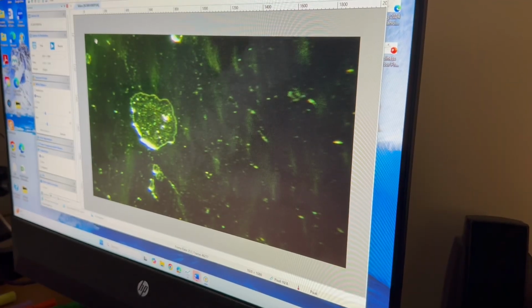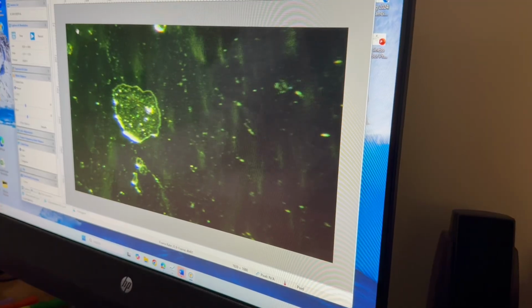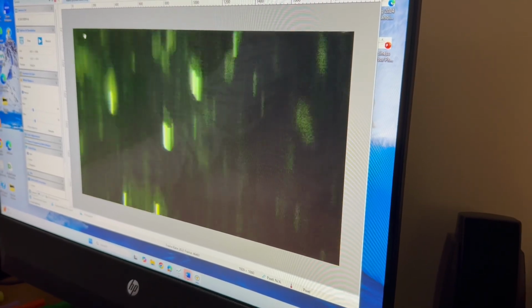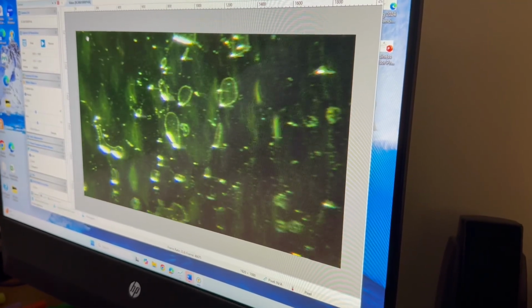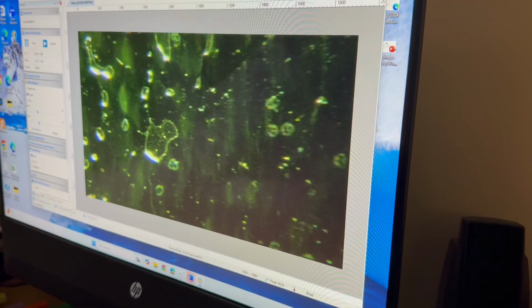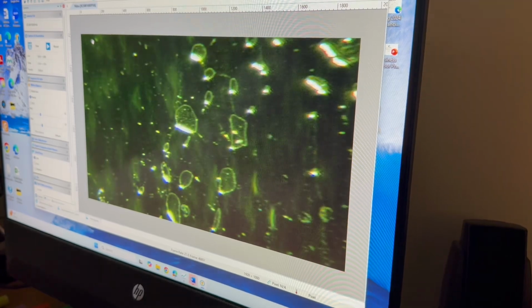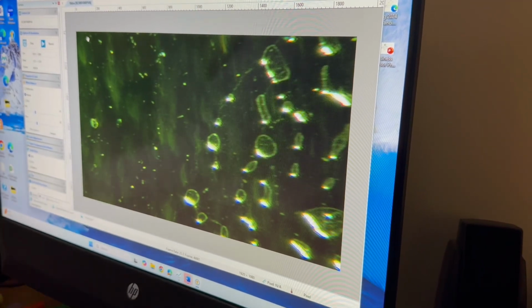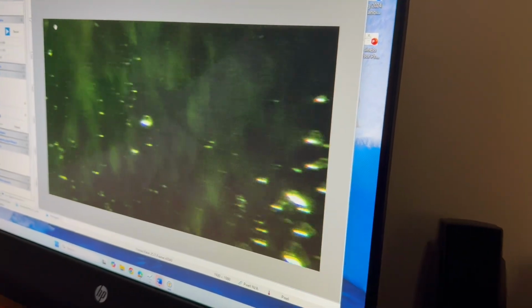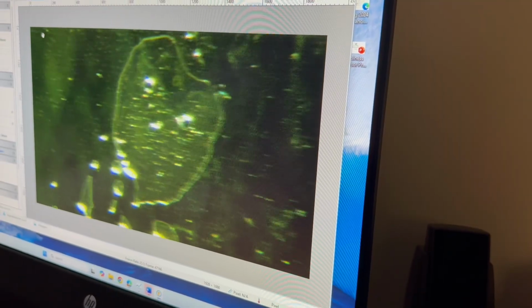So what was that? This one here is going to be this cholesterol crystal. Gives you an example of size, how big they get. They get bigger than that? They can. And these are where one would say those are graphene oxide. These things are like, we start to hit round. That's more like the graphene oxide. It's kind of like this one there. Look at that guy. It's a big one.